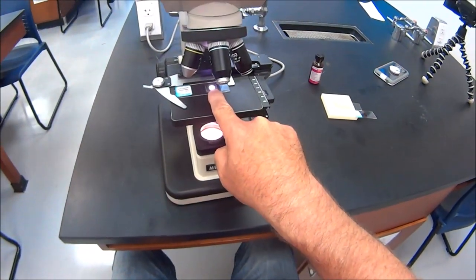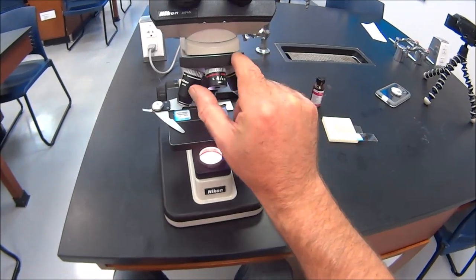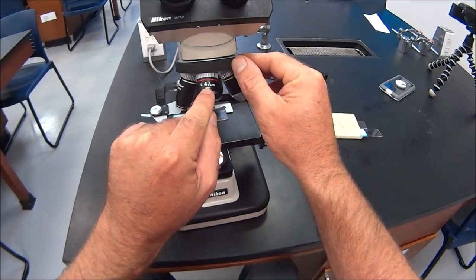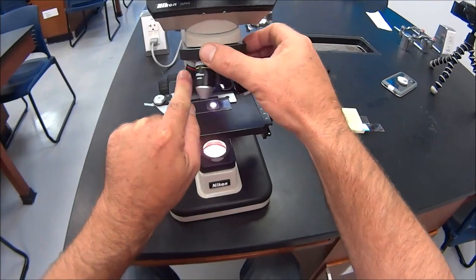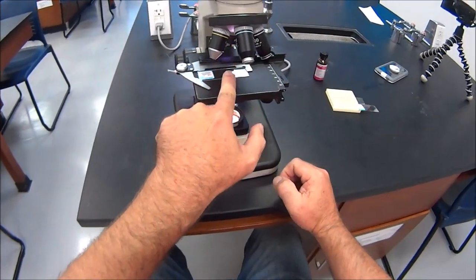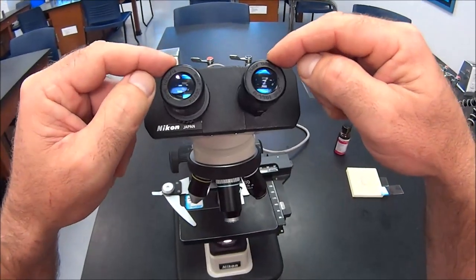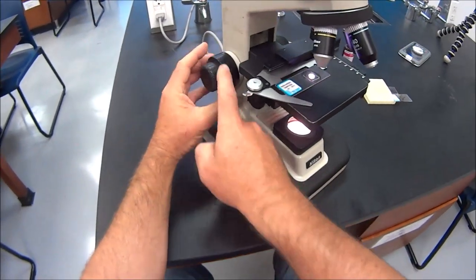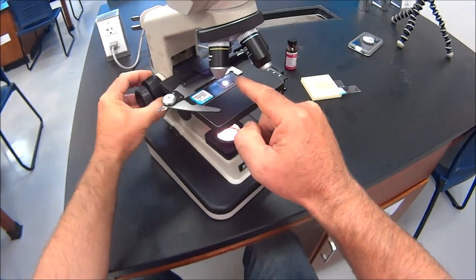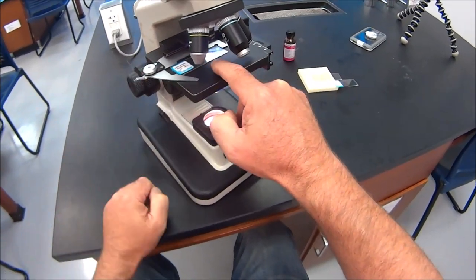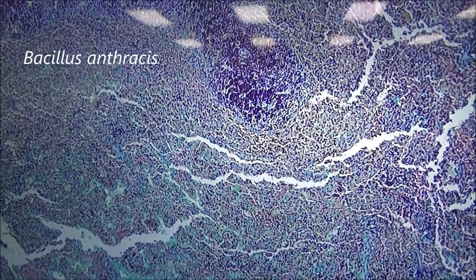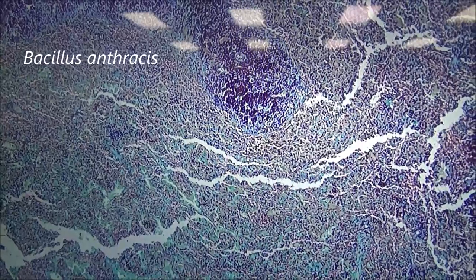So it's centered over the light. Now we get to pick one of these objective lenses. We always start with the smallest, which is four times what the naked eye can see. We turn the turret and put that lens over the light. We've got ocular lenses which we're going to look through. But we need to get this close to the slide, and to do that, we use the coarse focus knob. By turning this, it brings the slide up real close. Then we do the fine focus while we're looking through. Here's Bacillus anthracis at low power.